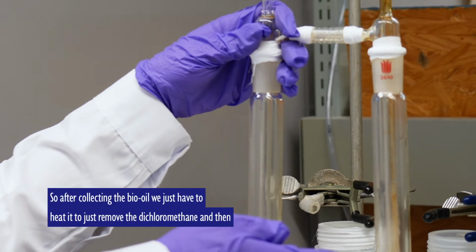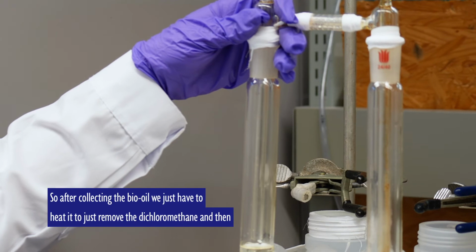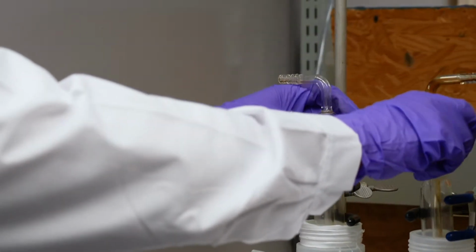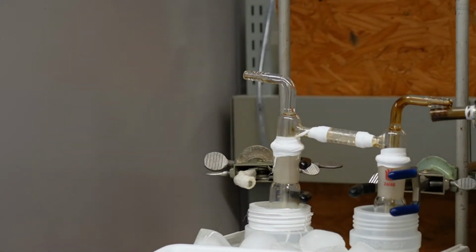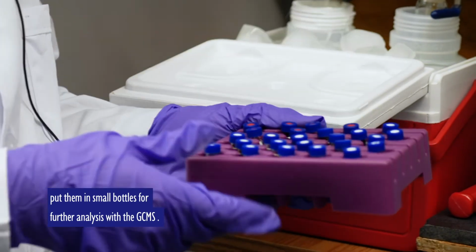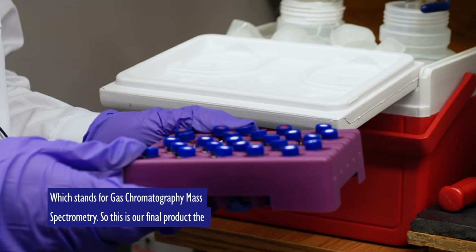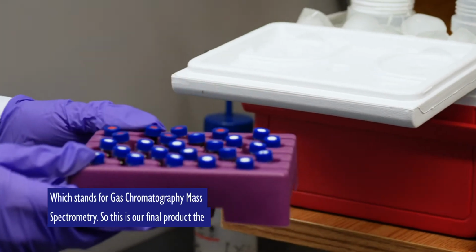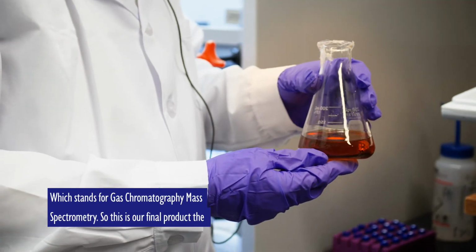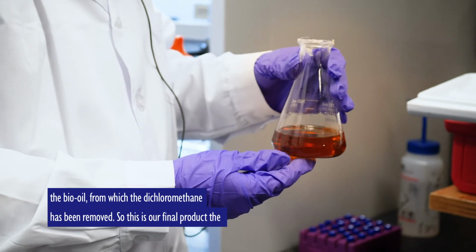So after collecting the bio oil, we just have to heat it to remove the dichloromethane, and then put them in small bottles for further analysis with the GCMS, which stands for gas chromatography mass spectrometry. So this is our final product, the bio oil, from which the dichloromethane has been removed.